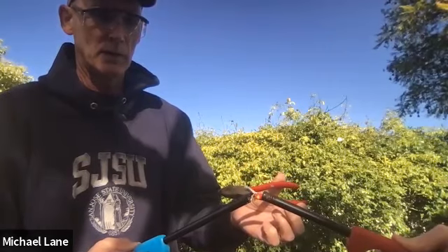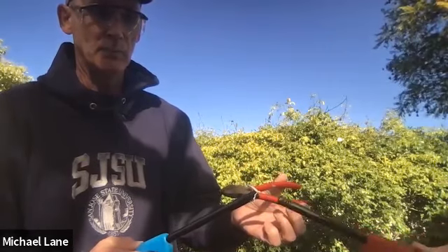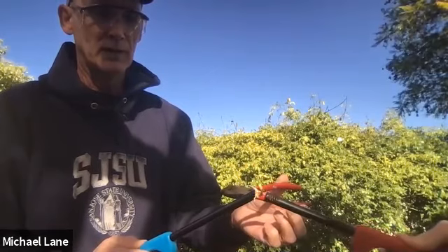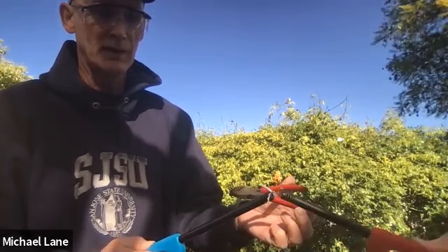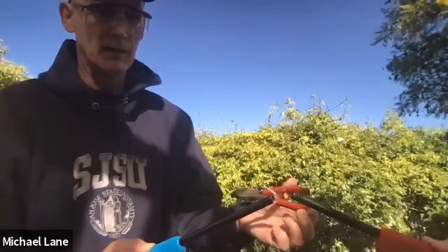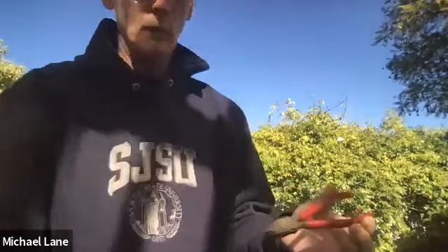Maybe not. What has happened is it only burned to the extent that it got down to where I hadn't sanded away the outside. So this simply may not relight. Okay, well, we're going to have to call that one good. I'll do some of the calculations in a bit. So we're going to set that one aside. Now let's go over the next demonstration.